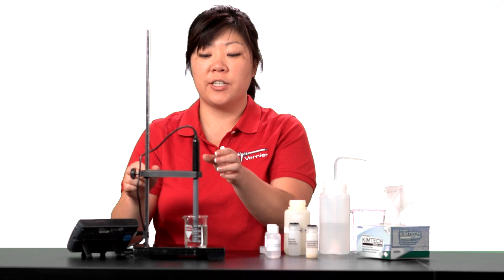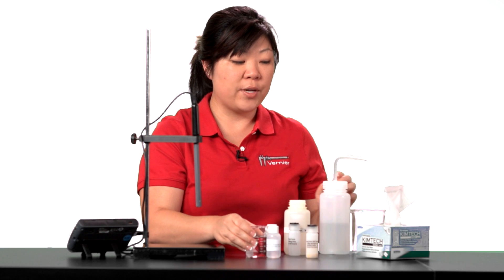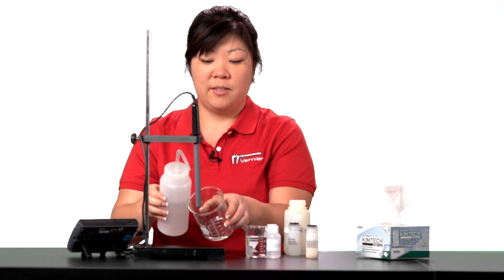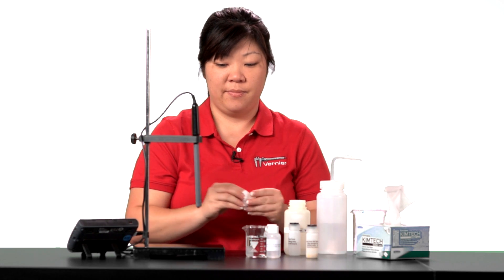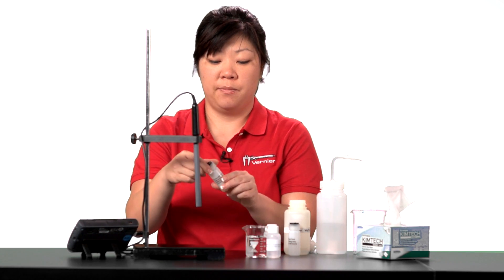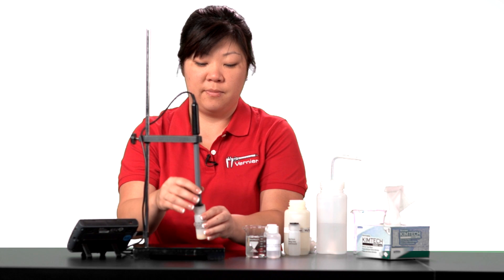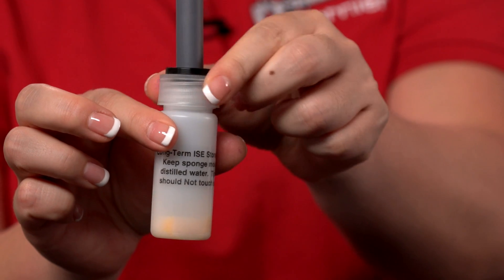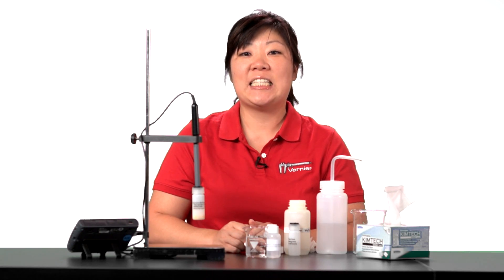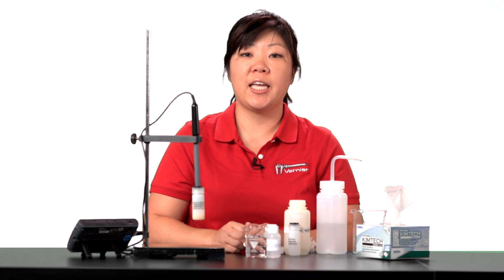Upon completion of your experiment, remove the sensor from the solution. Thoroughly rinse with distilled water. Gently blot dry. And place the sensor in the long-term storage bottle containing the damp sponge. Make sure the tip does not rest against the sponge. The ISE sensor booklet contains additional information on the proper care and storage, and also contains information on preparing the high and low standards.